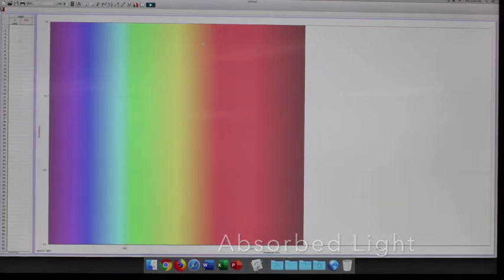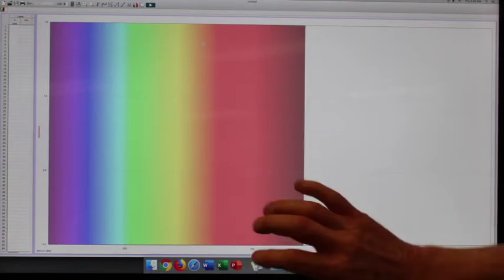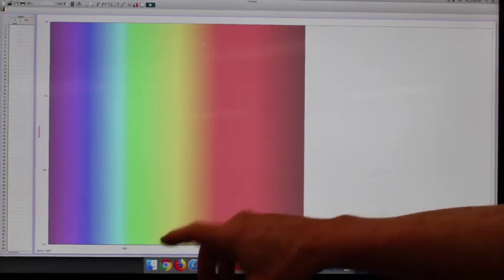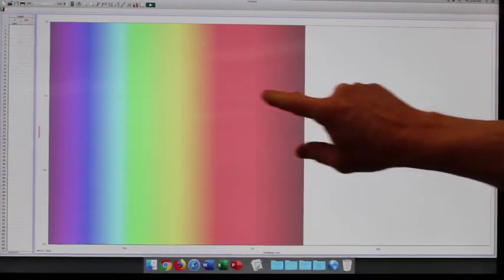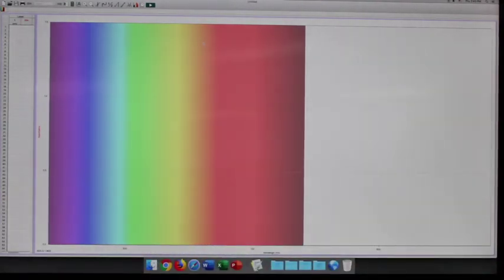So if something is purple in color, you'd expect it to be reflecting, and you'd expect it maybe to have a high absorbance. Things are more complex than that, and we'll show you that in a minute, but that's a good start for the color of light.